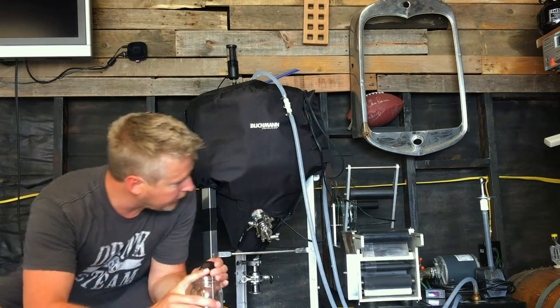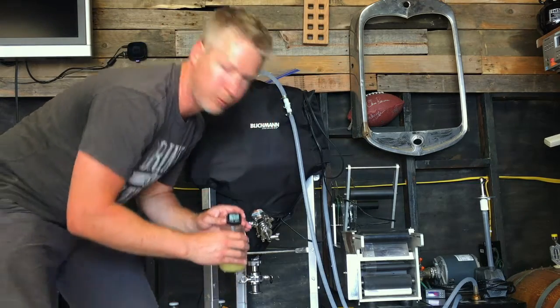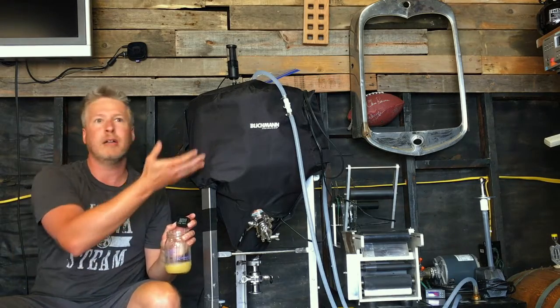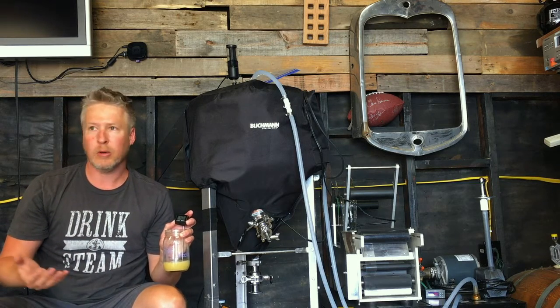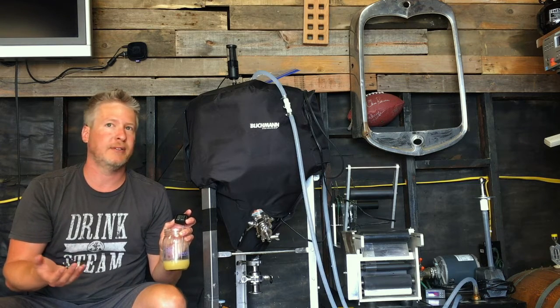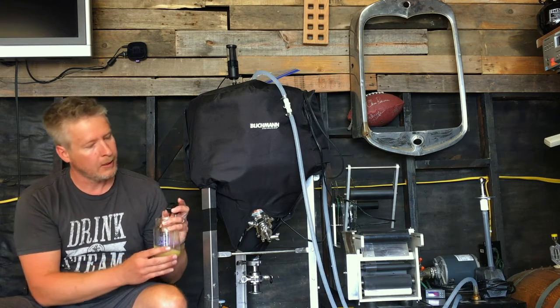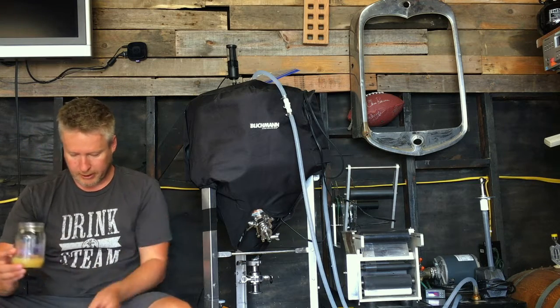And the reason you want to do that is so you're actually knowing what your set temperature is. In this case, we have a set temperature of 7.8. So just knowing that difference, whether it's a glycol system, whether it's a bucket in your deep freeze, or even just the beer that's in your closet, because as we know, actively fermenting beer at 70 degrees ambient could be as high as 78, 80 degrees actually in the wort. So 44 degrees seems good to me.